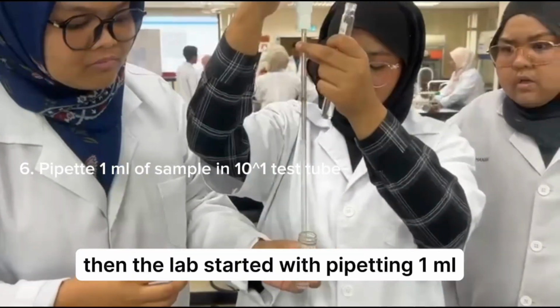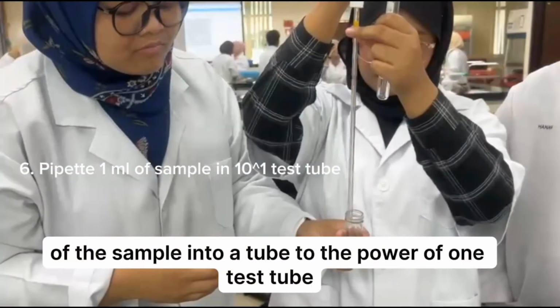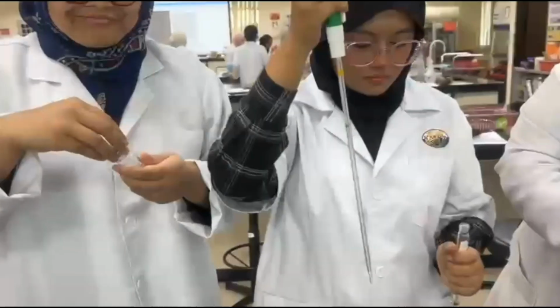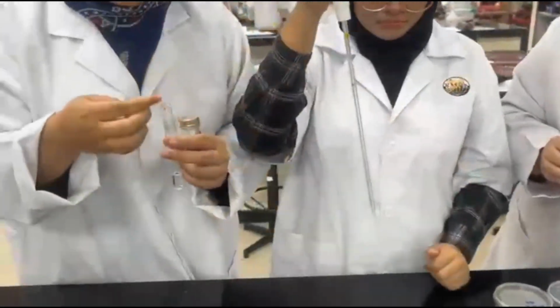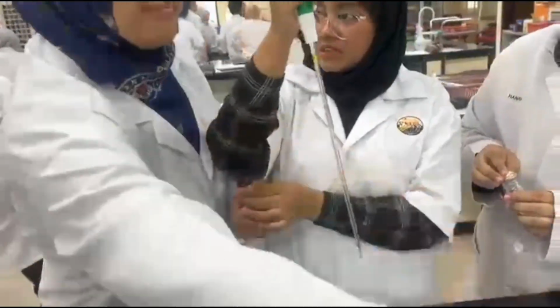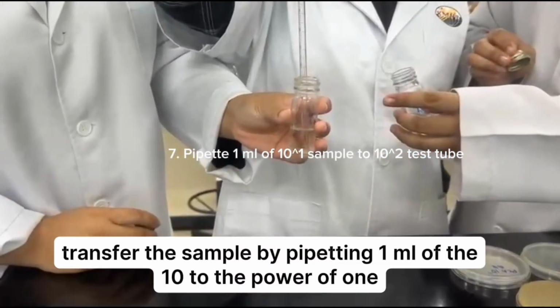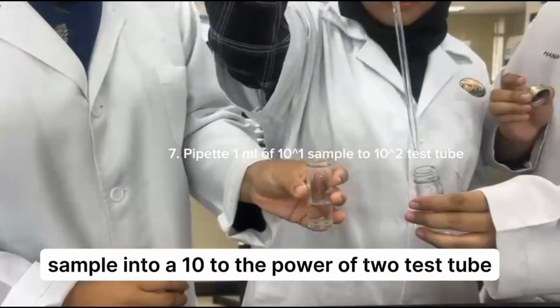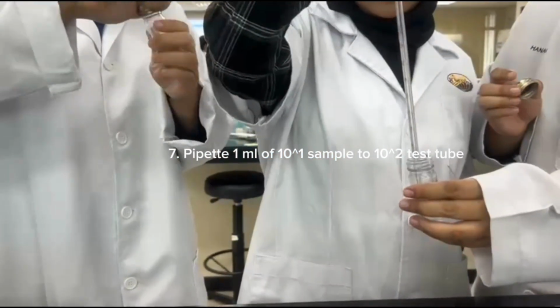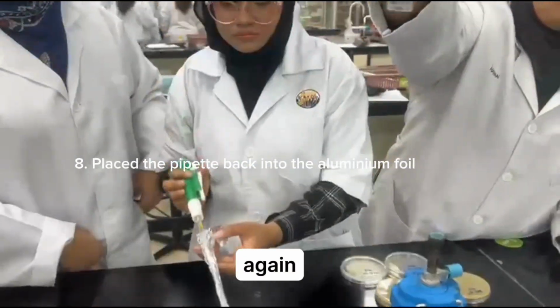Then the lab started with pipetting 1 ml of the sample into a 10^1 test tube. Next, transfer the sample by pipetting 1 ml of the 10^1 sample into a 10^2 test tube. Store the pipette in the aluminium foil again.